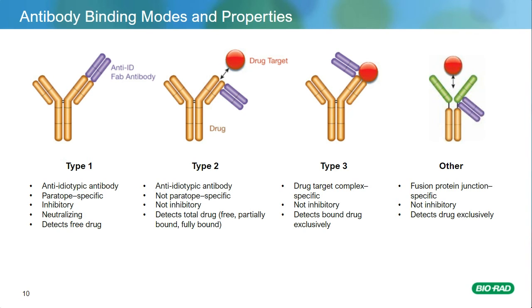And one thing I'd like to point out about all 4 of these different strategies is none of them use peptides. So quite often we hear customers assume that they've identified by sequence analysis something that's unique on their drug, so they assume they need to make the peptide, we generate antibodies to the peptide, and then we see if it binds the conformational folded form of the protein.